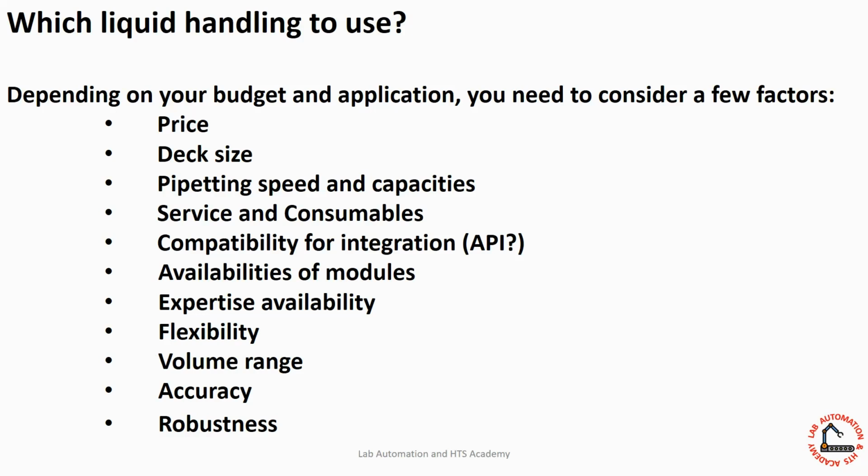And then we have the flexibility. What that means, for some applications, for example, you are working in a testing lab. So you are going to run the same assay probably 24/7 on the same robot. So flexibility probably is not that important for you. You program the robot, you test it, and then you run it 100,000 times. So flexibility is not the case for you. But if you are working in a small lab and you have a limited budget, you cannot purchase a robot for each workflow. You want to have one robot and use it for 10, 12 different assays.